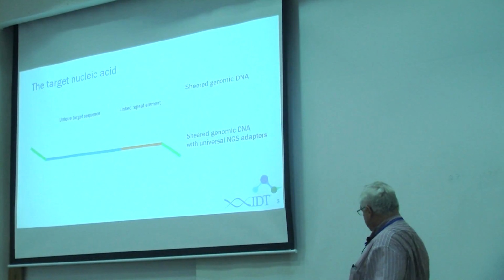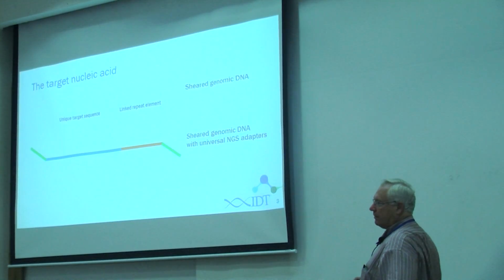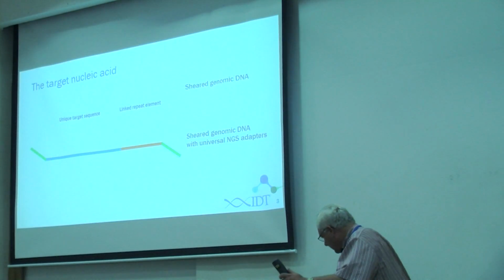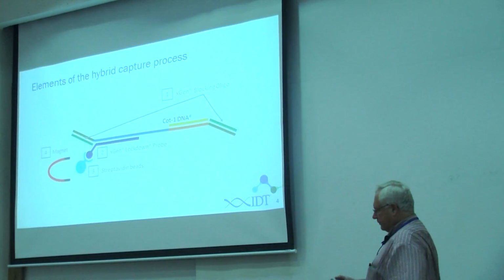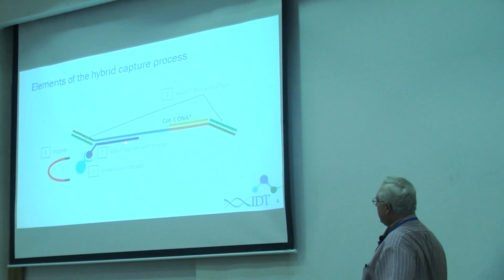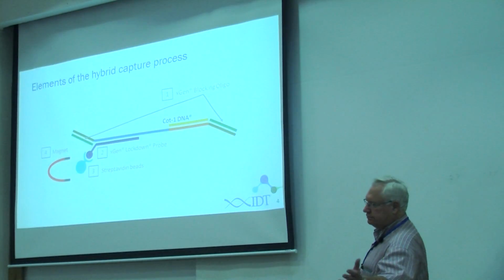Well, capture is going to take a library fragment, so you've got a piece of genomic DNA here, and it's going to have the target sequence you're interested in. It's going to be linked possibly to junk, which could be repetitive elements, which are mischief. And it's going to have universal adapters on the end. And the way a capture-based reaction works is you're going to have some kind of a DNA bait, a hybridization capture probe that's going to bind on it. And it will bind to this chunk of DNA, and it will bind to this streptavidin magnetic bead. You'll fish it out, wash it, and other stuff will wash away.